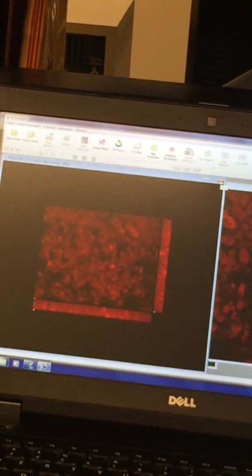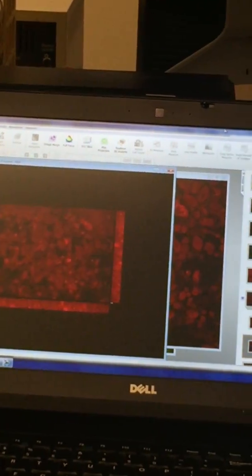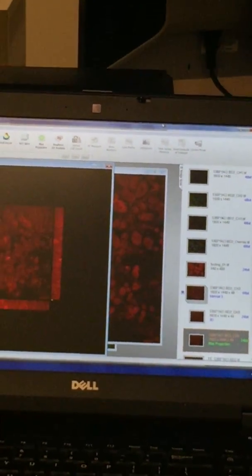What's the maximum imaging width of a sample that you could use using this? Width or thickness? Or thickness, yeah. The microscope itself can image 8 millimeters in the Z. We say anything about 150 microns or less, the system can handle no problem. Anything over 150 microns, we recommend using a clearing technique. Not any technique in particular, but just clear the sample. But at the same time, we've imaged heart sections that have been 4.5 millimeters thick before, and it looked awesome. And that wasn't cleared at all. So it's really sample specific. I'd say push it to the limit and see what you can do with it, because it's the only way you'll know. We don't really have a direct answer for that, honestly, because it really depends.